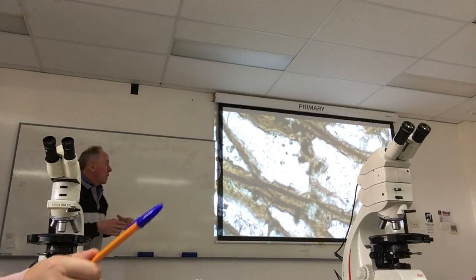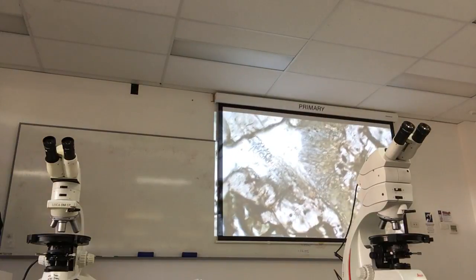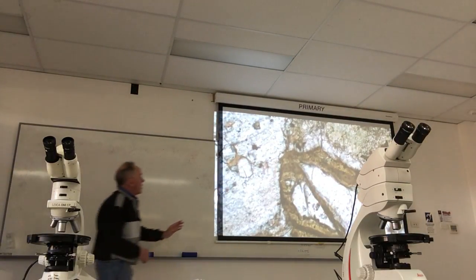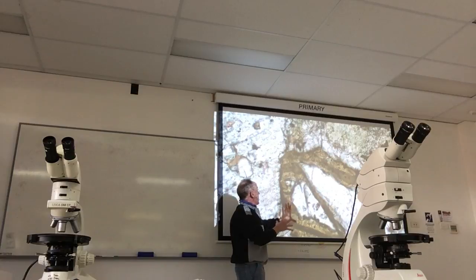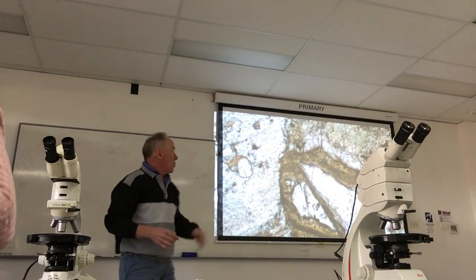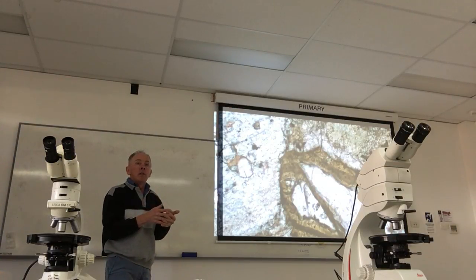If it was hornblende and it was just around the outside, let's go to the edge of the grain. Whoops. You would certainly see it around the margin of the grain like this, but it wouldn't be this fibrous structure. It would be optically continuous. You wouldn't have all separate grains. It would be one grain. It would all go extinct at once. It would all have the same birefringence. You wouldn't be able to see those fine needles inside it. So don't mistake alteration for overgrowth.